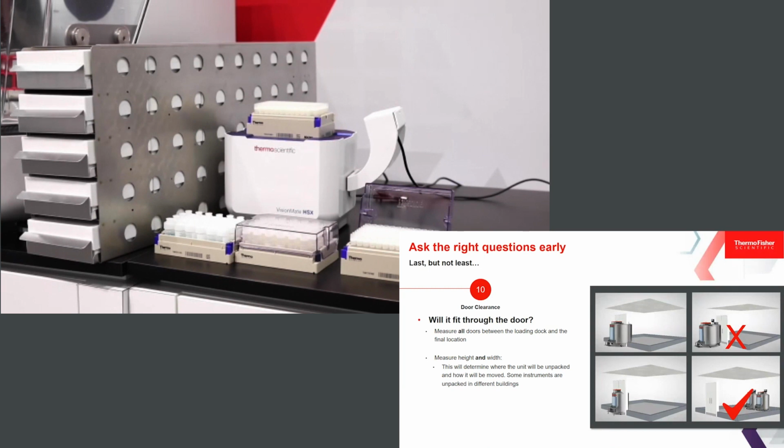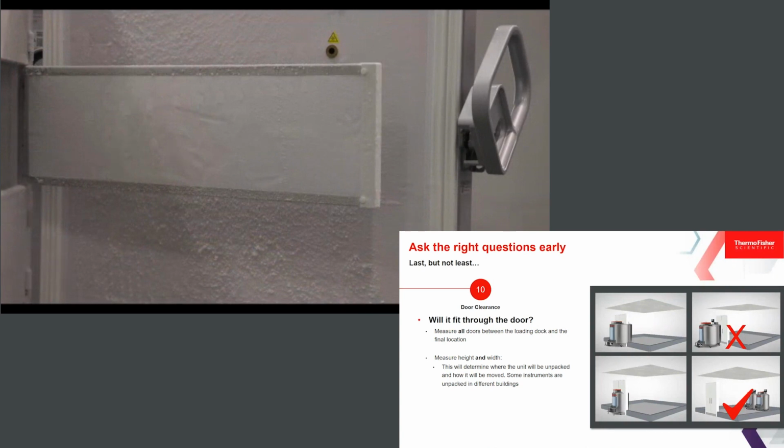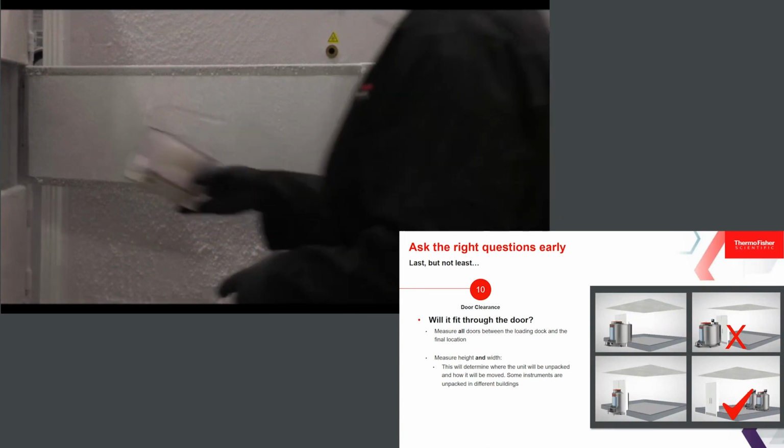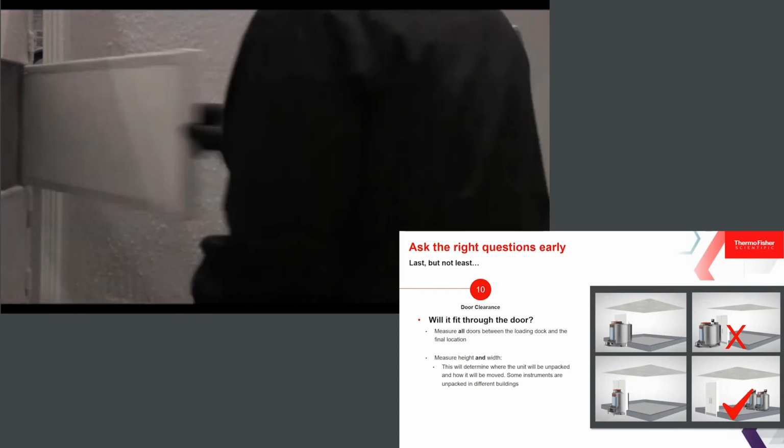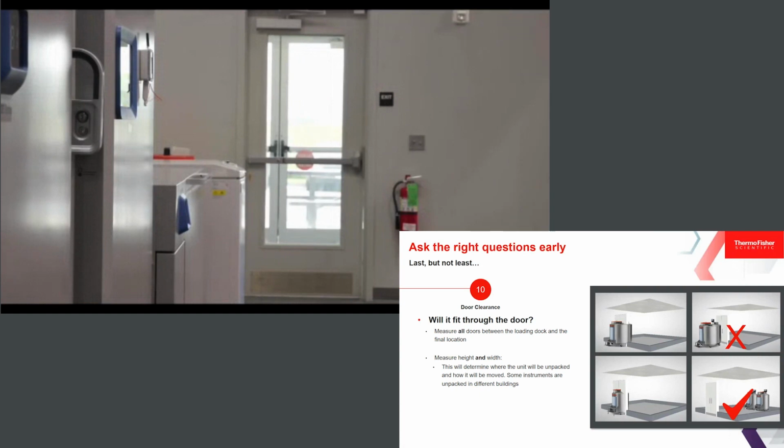And then last but not least, you've taken all this care in selecting the right product. You want to make sure it fits through the door. So not only do you need the right plug to get up and running quickly, but you want to make sure that that freezer fits through the door. So, thank you, Danny, he's getting our freezer ready. There's our doorway. What can you do?